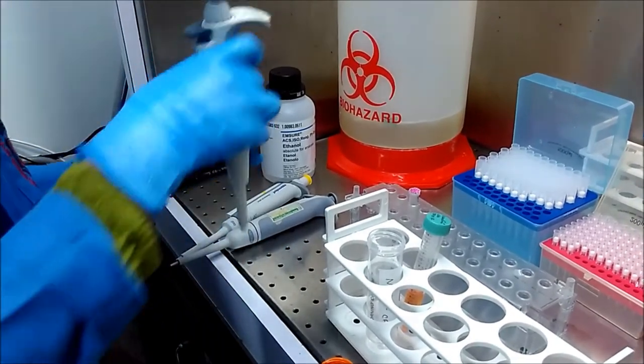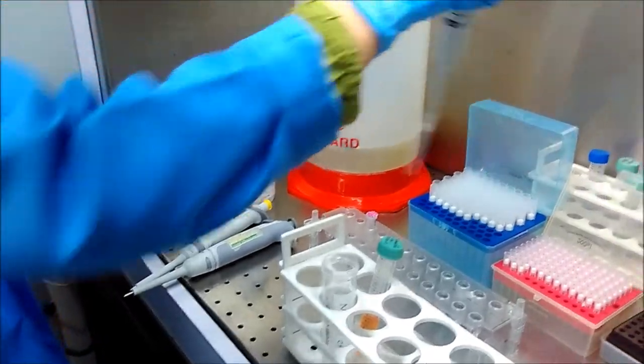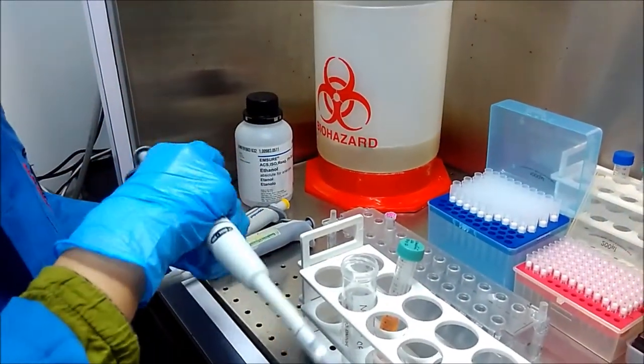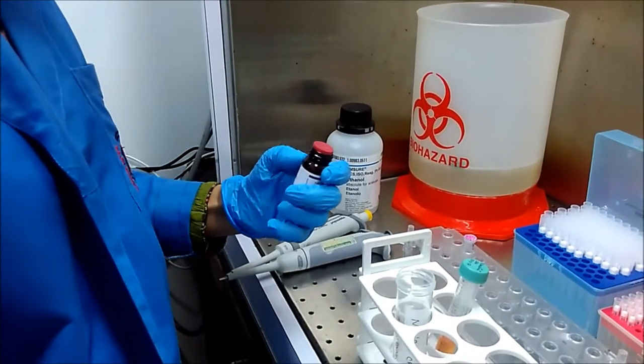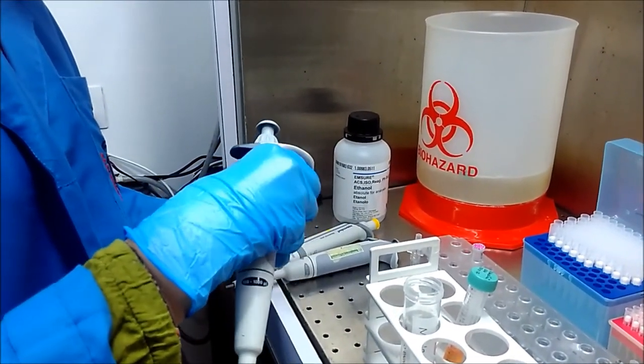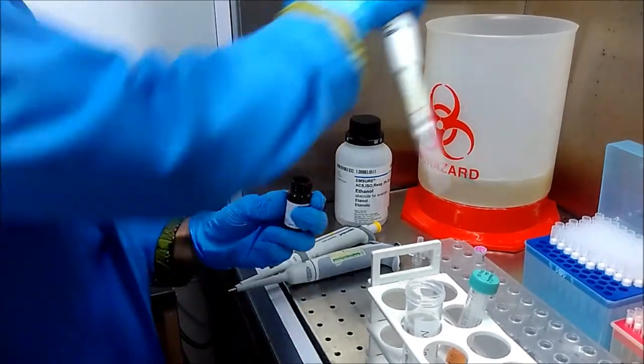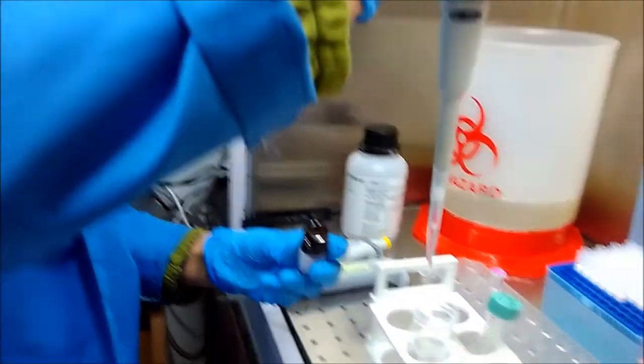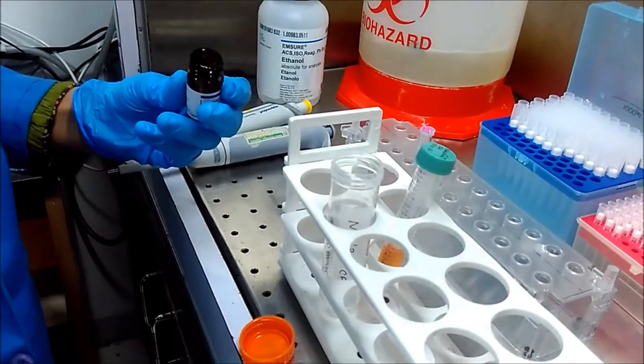First, we will take a 50 ml centrifuge tube in which we will add 500 microliters of Proteinase K. Proteinase K is basically an enzyme which will degrade all the proteins and protein disulfide bonds. So we will add 500 microliters of Proteinase K here.